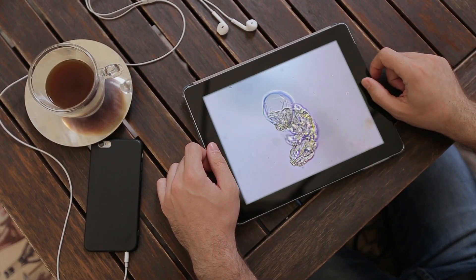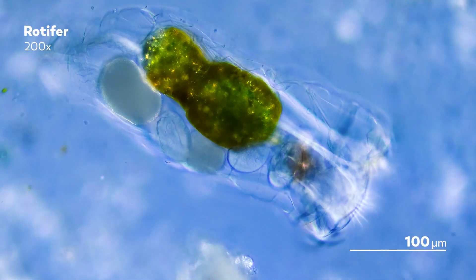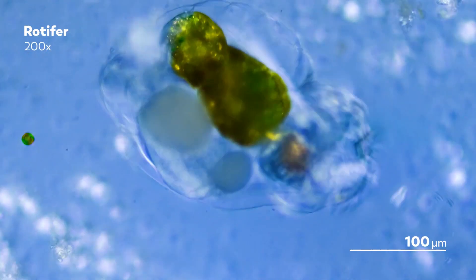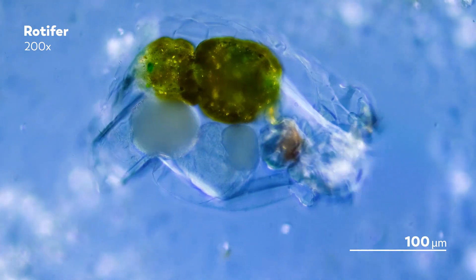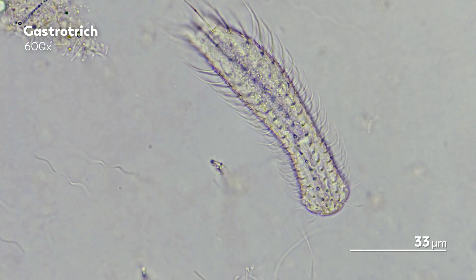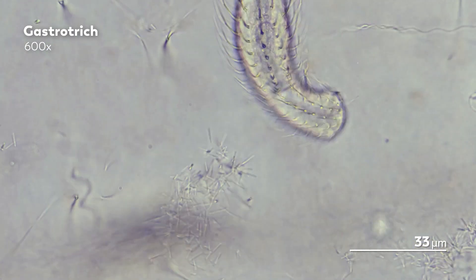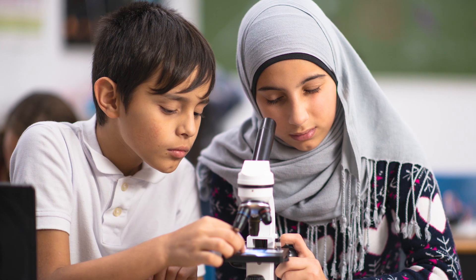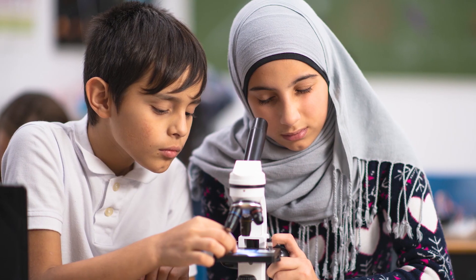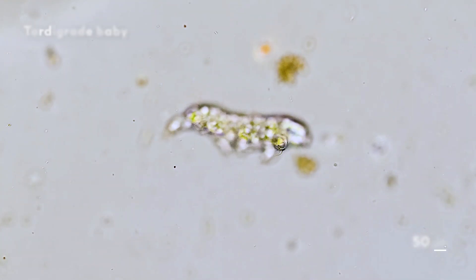Sometimes all you need to do is a simple search for something like "freshwater microscopic animal" and look through images until you find something that matches what you're looking at. Of course, that can bring up a whole range of species like rotifers, hydras, and gastrotriches — but each of those animals is very different from the others, which can help narrow down what your unidentified organism is and is not. If you find this process overwhelming at first, that's okay. Every time you do this, you will get better at it. It takes years of practice and experience, and like a baby tardigrade waving its legs for the first time, we all have to start somewhere.